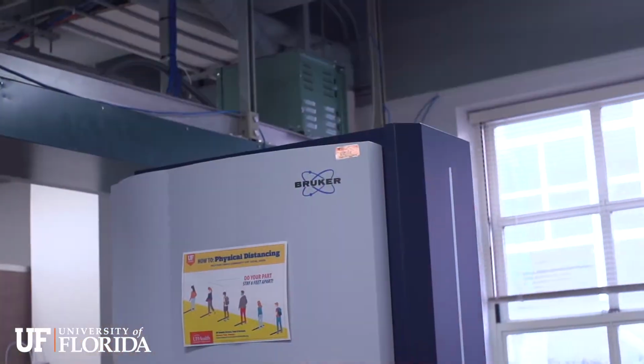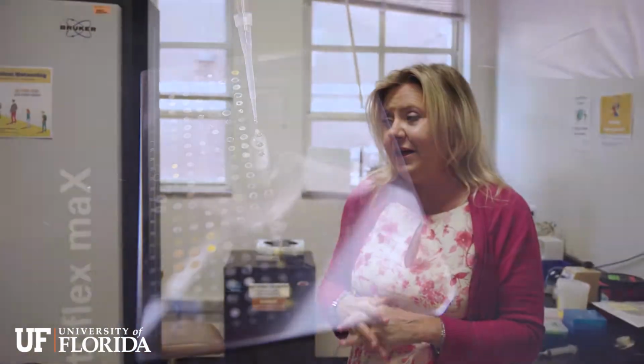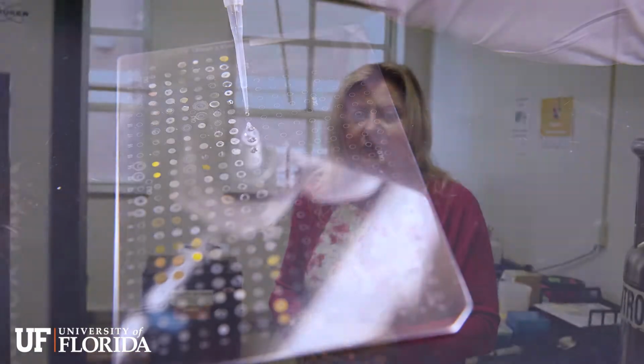And here we have our MALDI mass spectrometer. This also is available for self-operation. So as a student, you can come and be trained on the instrument and operate and run all your samples yourself. What is interesting about this instrument that we have found is that it can be operated remotely. So you can bring us your plate, we can put it in the instrument, and then you can go home and you can run your samples from wherever you want to, whether that be from your living room couch or back in your lab, back in your office.